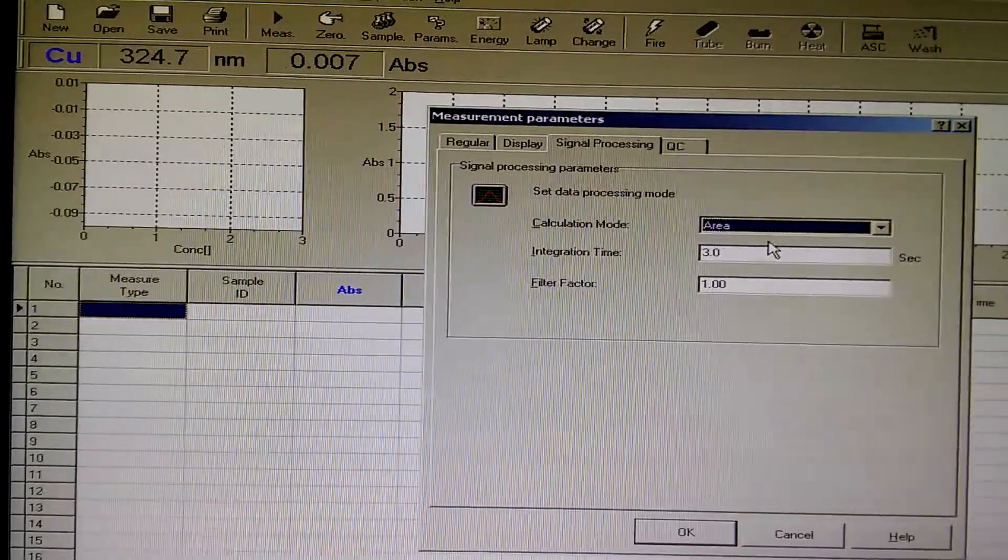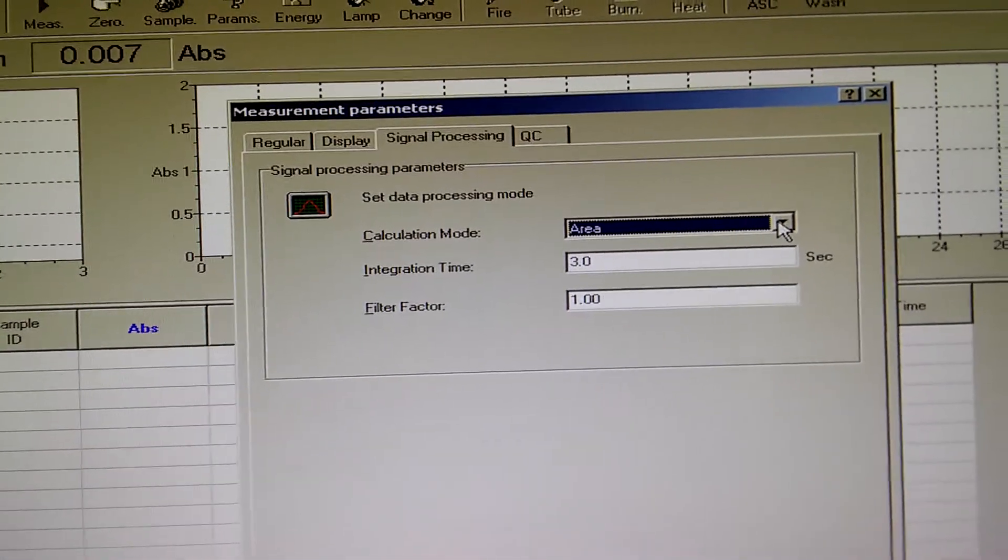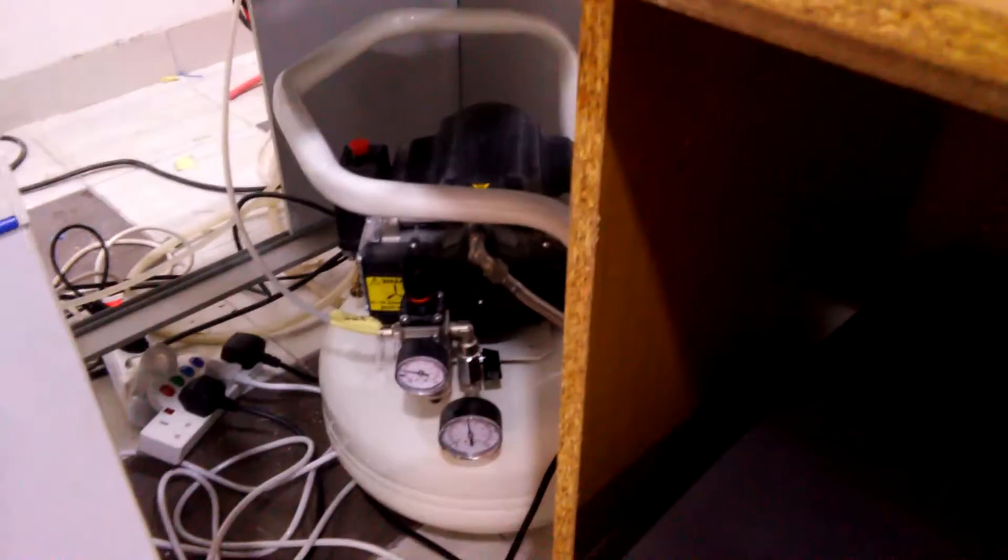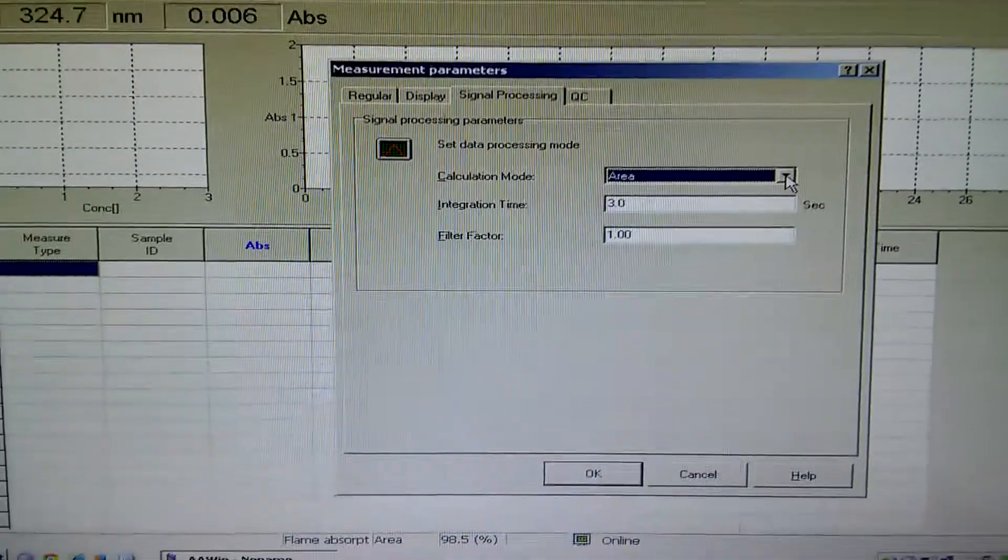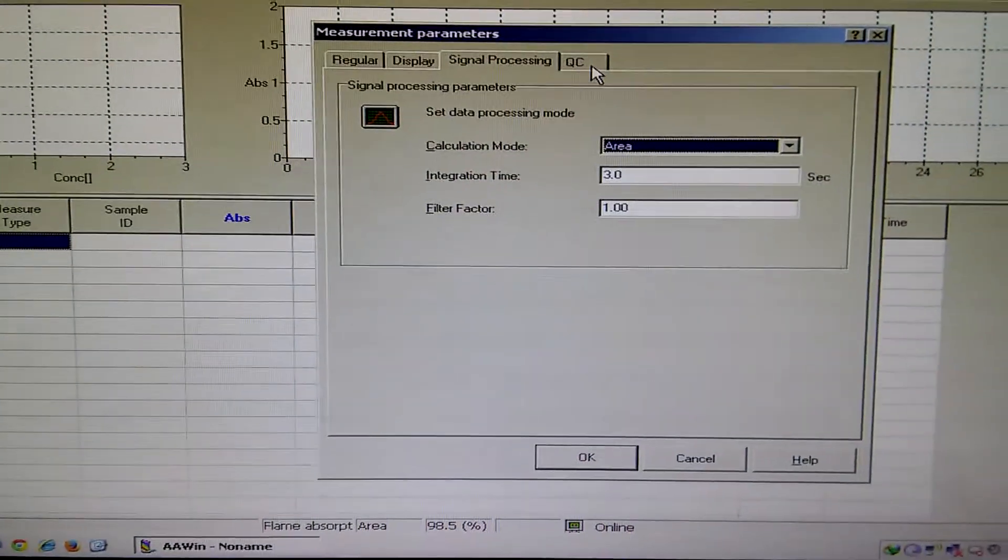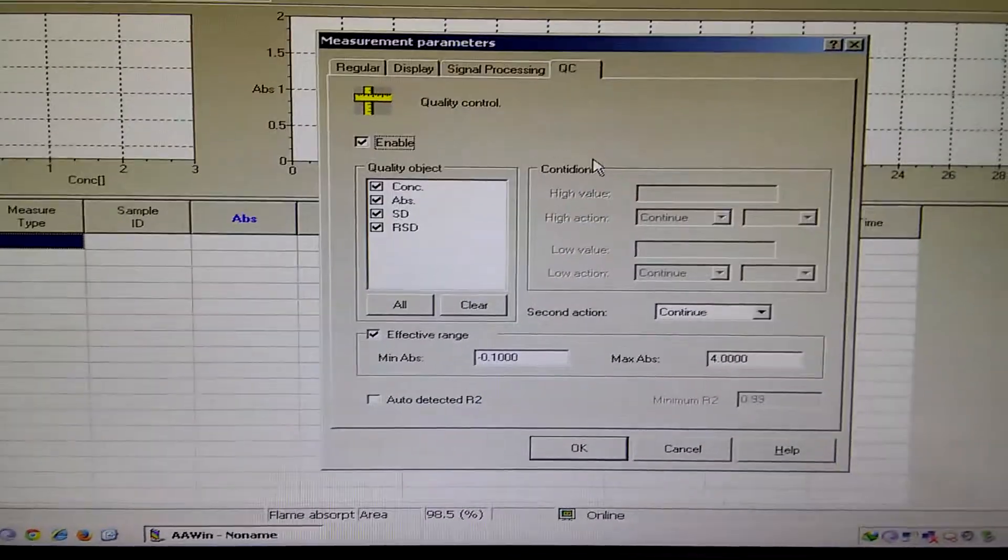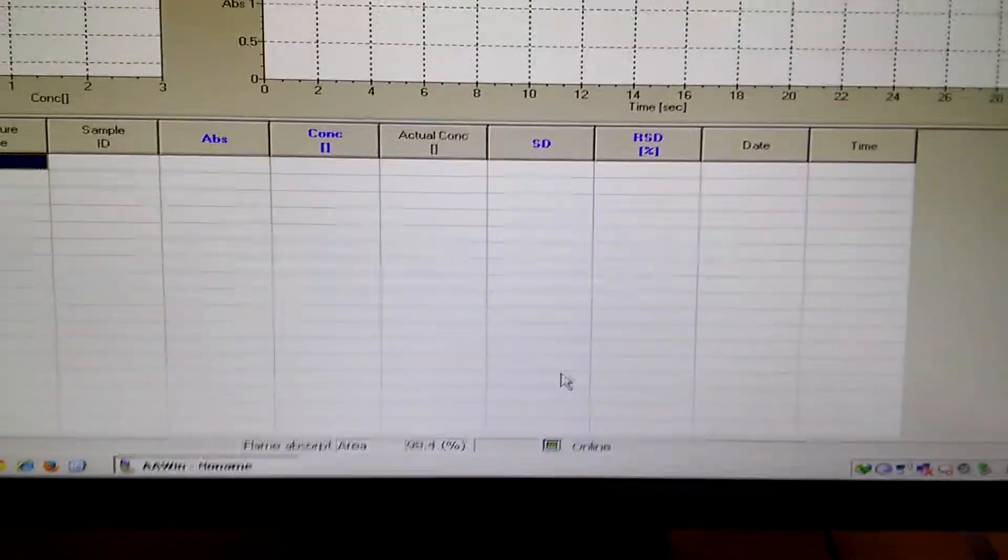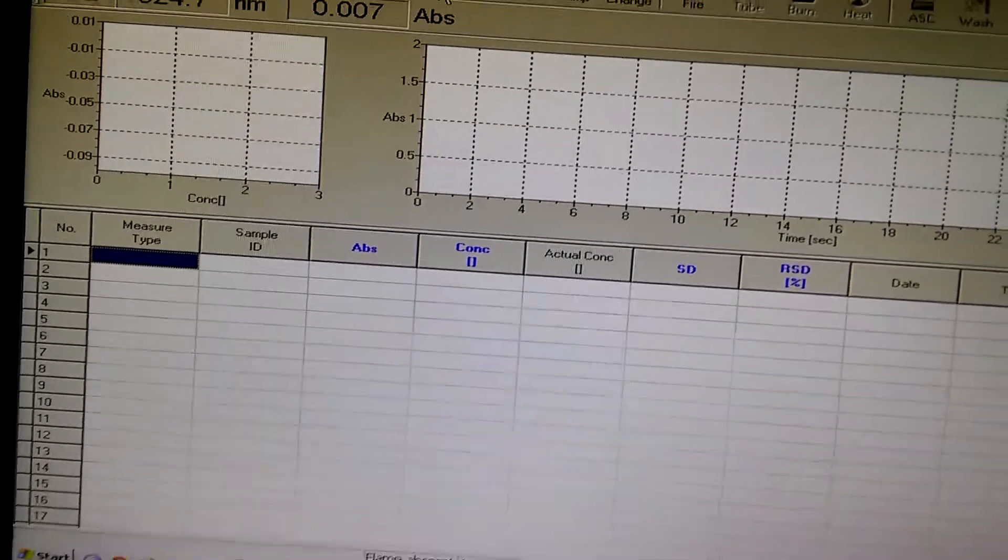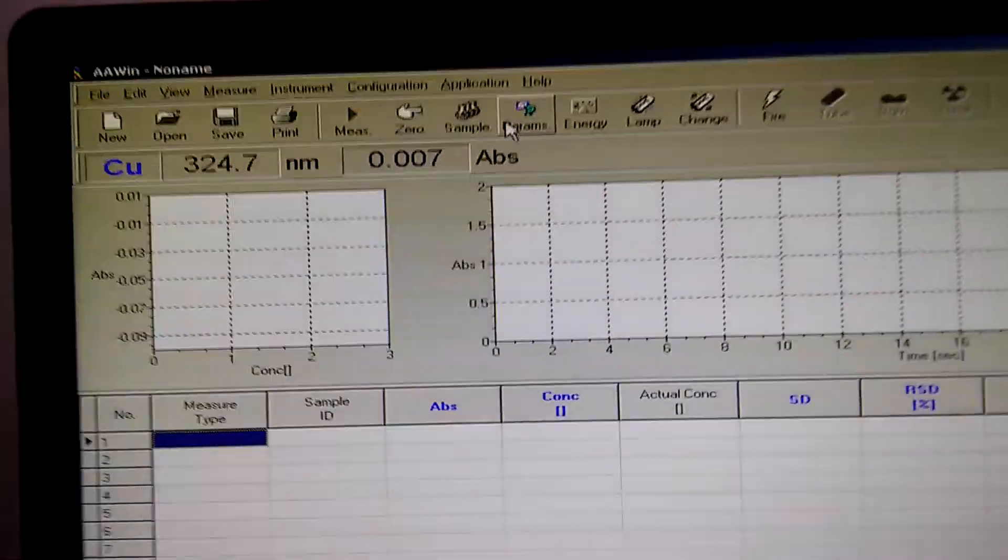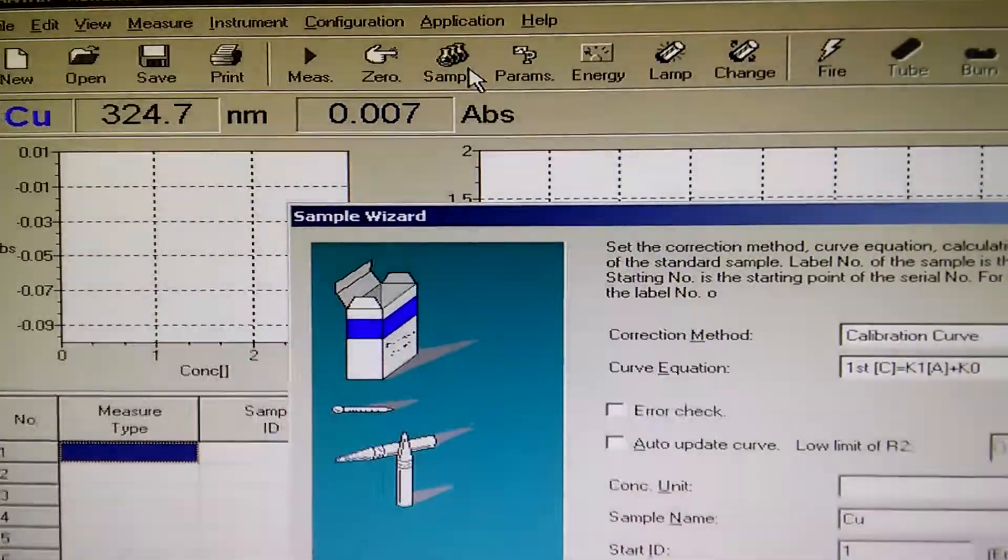Now we are going to calculate the area. This is the air compressor started. Sounds very loud. Now let's check the quality control panel, press okay. We have finished from the parameters, let's set the samples.